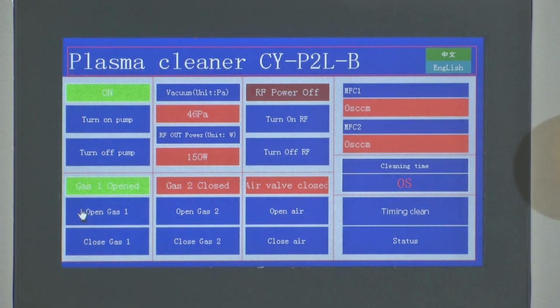Okay, some defined amount of oxygen is there at some pressure. It's difficult to control it. So now this shows that there is oxygen. Okay, now we have created vacuum. We have allowed oxygen to come inside. So next step is to switch on the RF power. Okay, so let's switch it on.